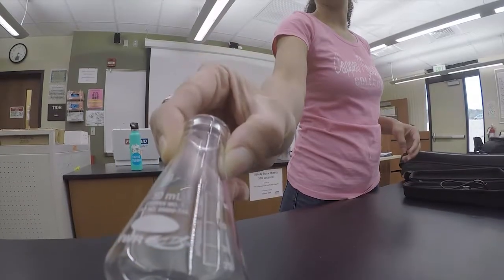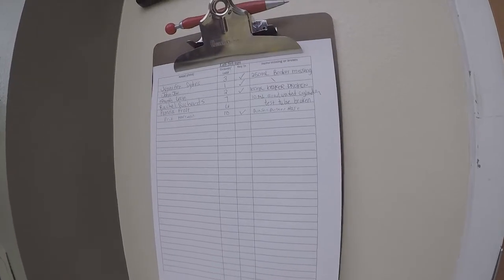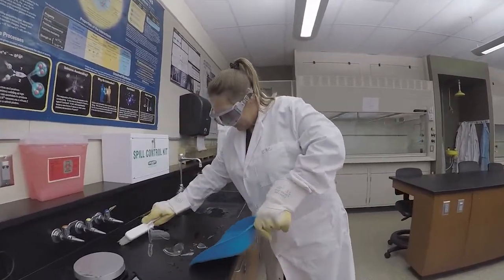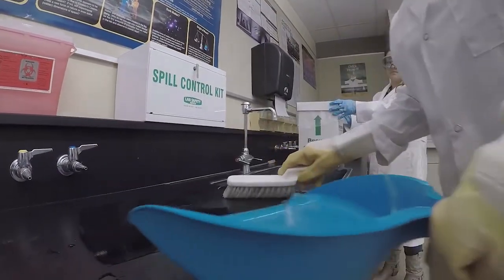When working with glassware, check for any chips or cracks. If it is cracked, alert your instructor and dispose of it accordingly. Take the time to record what type of glassware it was, including the size, next to the corresponding drawer number in the comments section of your key sign-out log. Remember, if there are shards of glass present, use the glass cleanup kit to handle the glass.